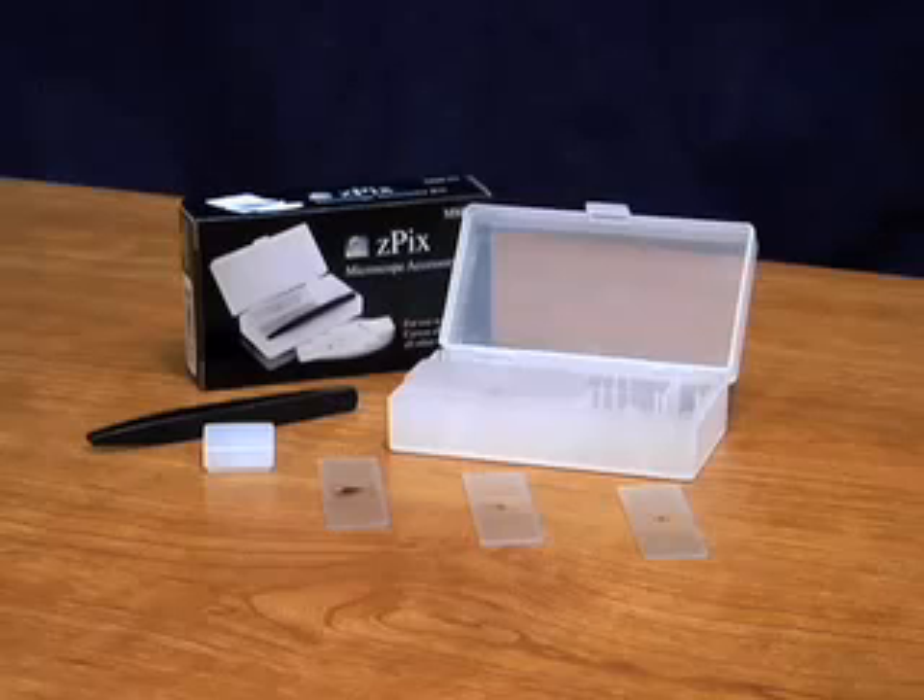For more options, try the Z-Pix Microscope Accessory Kit. The Z-Pix can be used for many different things. You can use it to view coins and stamps or even bugs. It also has many industrial uses — you can view coatings of plastic, metal, or even glass. It can also be used in the classroom. The possibilities are unlimited.